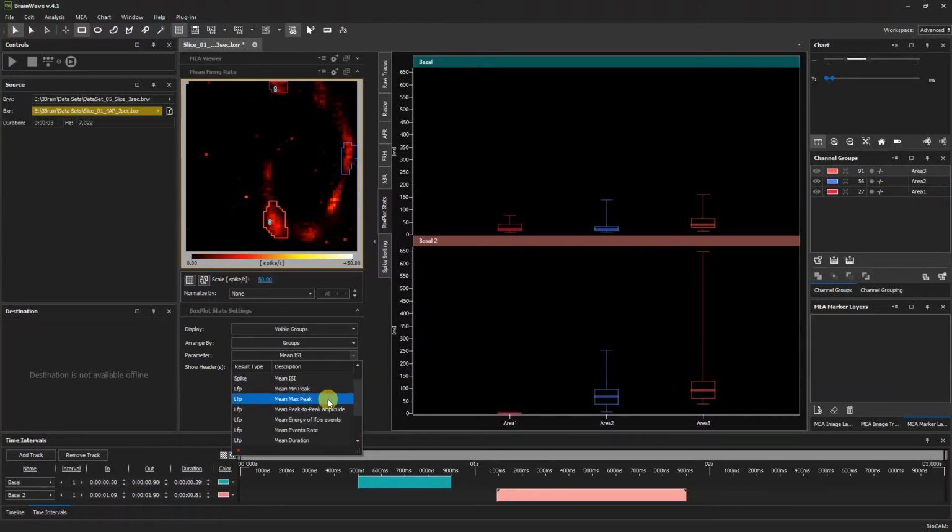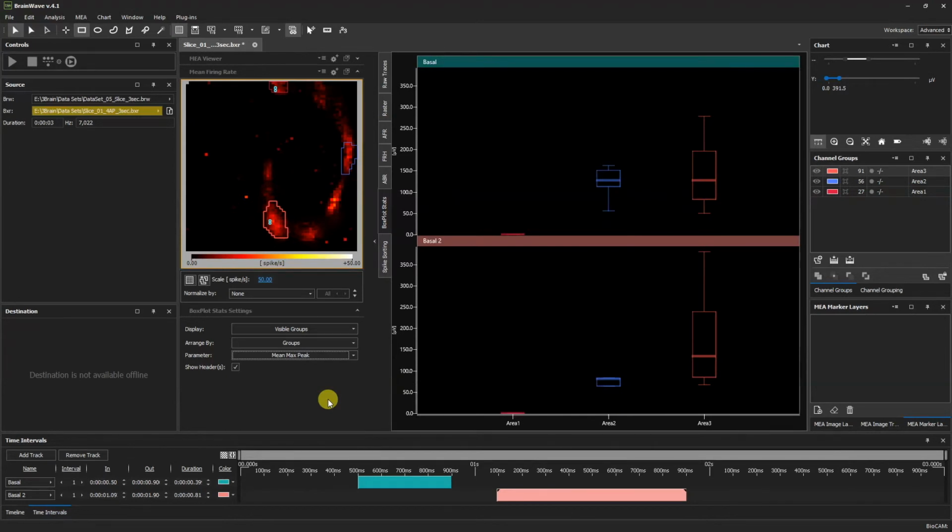for our LFPs. As is the case with all of our analysis tabs, our data can also be exported by going to Chart and clicking to export the image that we see in our Analysis tab, as well as in the mean firing rate map, as well as saving the data to Workbook, which will export the data into an Excel file.